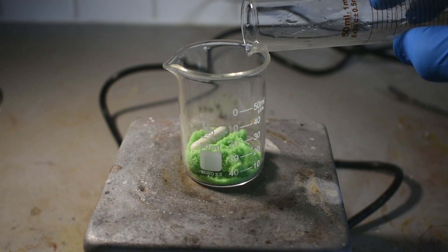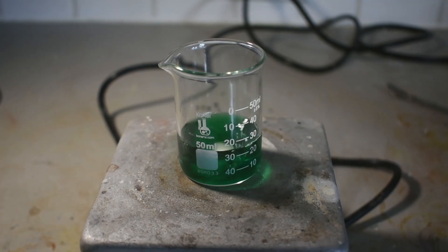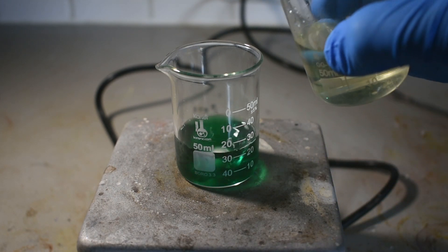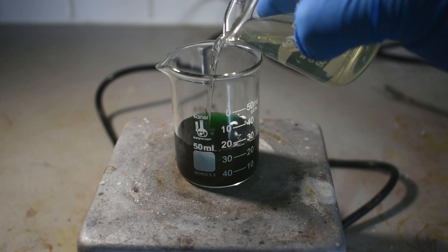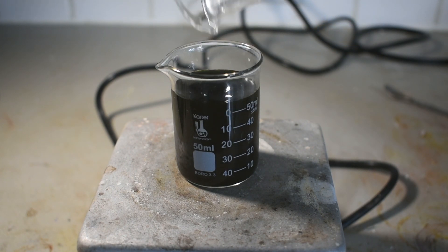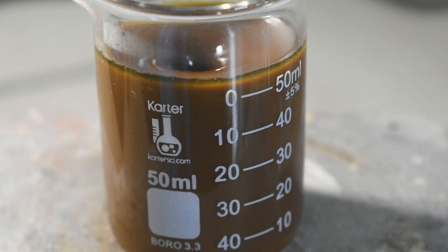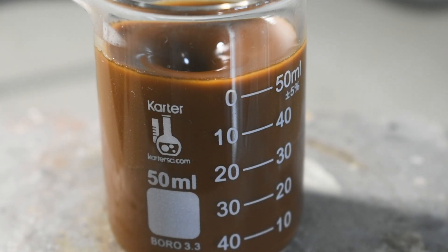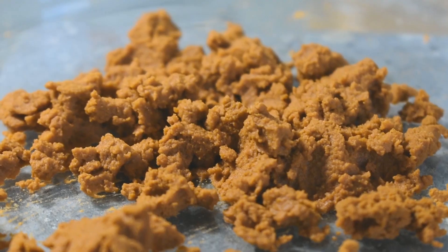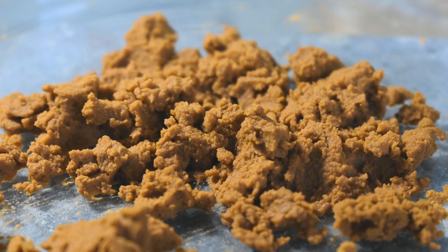In a separate beaker, 10 grams of nickel chloride hexahydrate are dissolved in 10 milliliters of water. Once that's dissolved, the potassium nitrite solution is added directly all at once to the nickel chloride solution. The solution will darken initially, and after a couple more seconds we'll start to see our complex precipitating out as a sort of muddy orange powder. Our product is filtered, washed a couple times with ethanol, and then dried in open air. It's important to note that you really can't wash this with water, as water decomposes it.